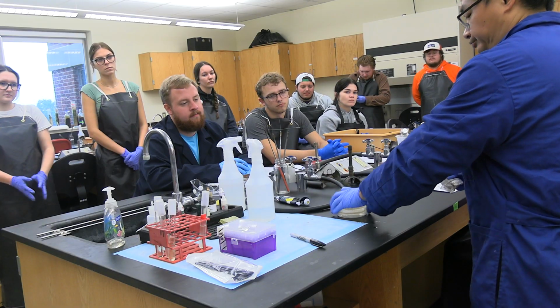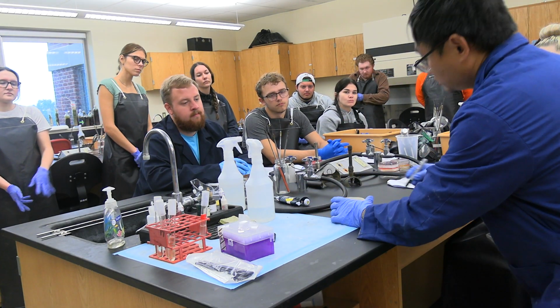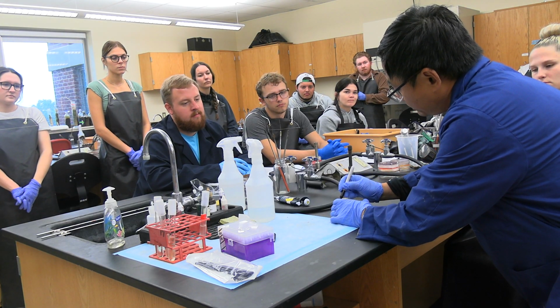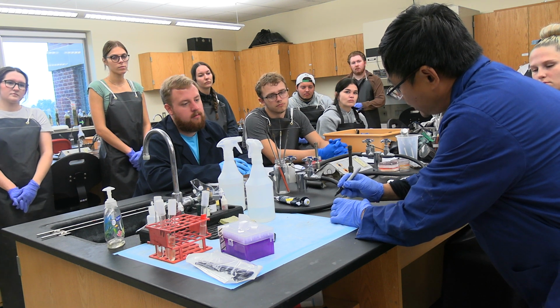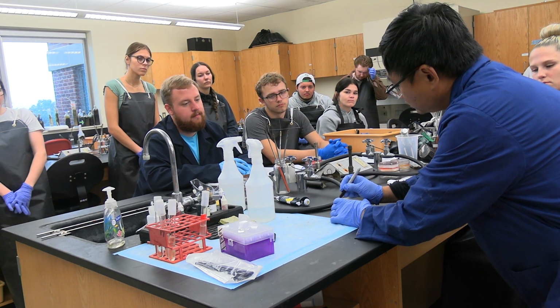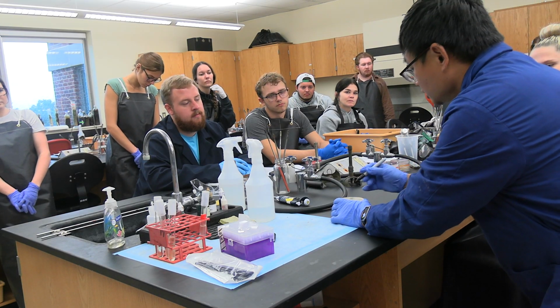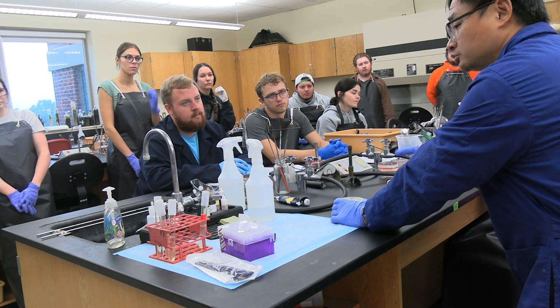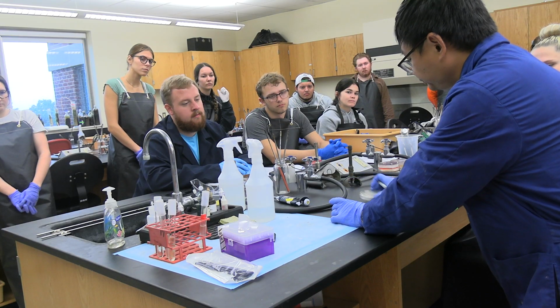Then what do we do? We'll do a label. Label the plates first. On the side, your name, initial, bench number. Let's say E. coli, this is what we're going to do today, and the date, 0925. That reminds you how many days of incubation. Don't forget the important thing, the final dilution factor of the plates. Today we do 10 to the power of 3.